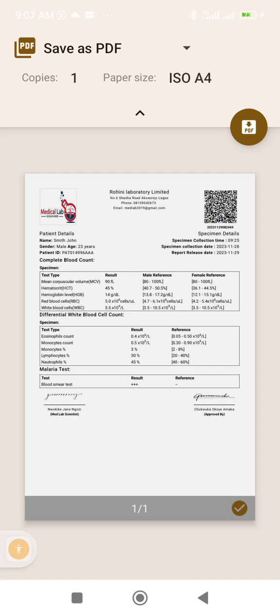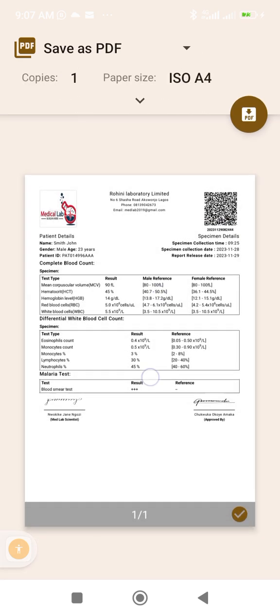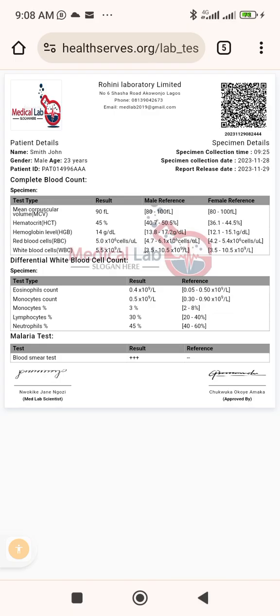There's another printer I put on this system, and that is because you can see the final result for this patient. So if your phone has a Bluetooth connection, you can now send this to your printer and print it from your phone. And everything we have described here also applies to the computer. In fact, it is much better if you're using a computer. So this is the actual result. The other one we were seeing is the PDF interface for it. So this is the result.